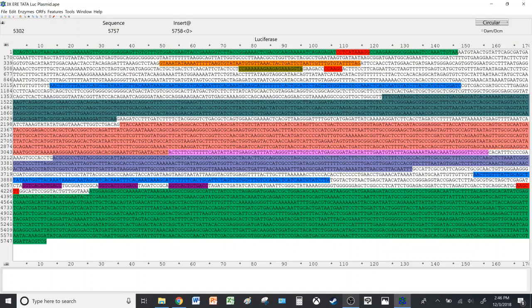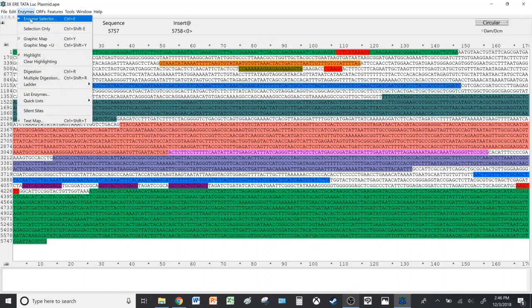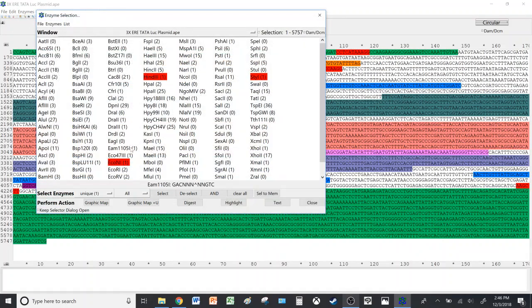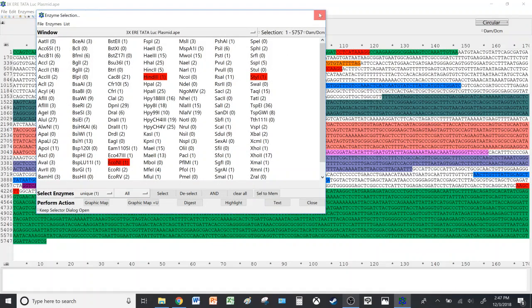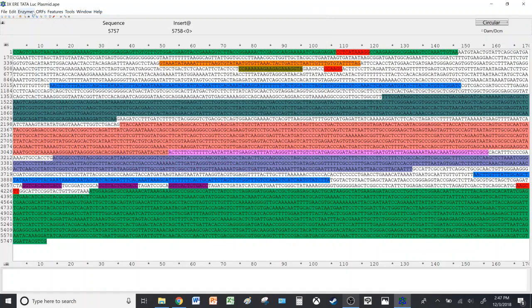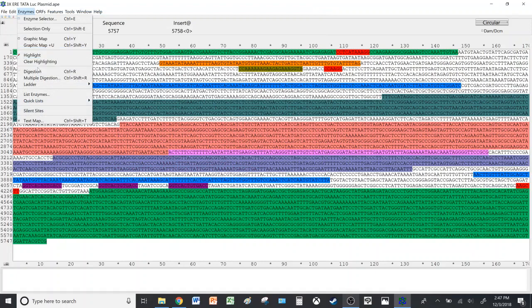So that's with regards to highlighting. Now let's take a look at the digestion. Let's make sure that the enzymes we want are selected.